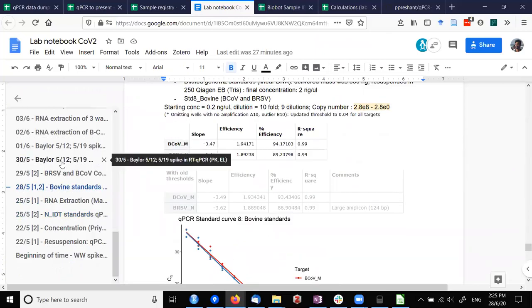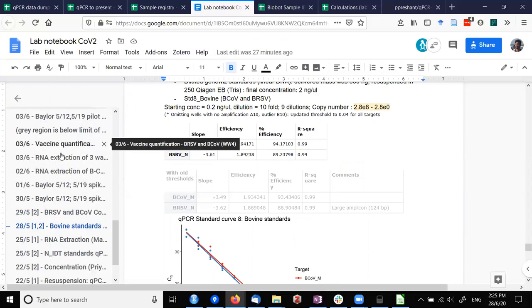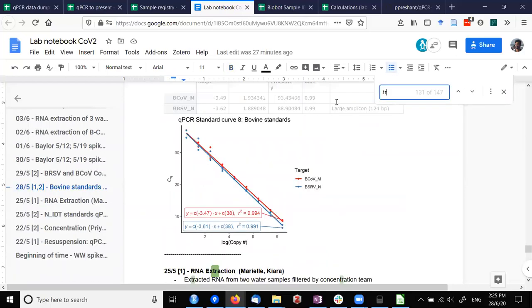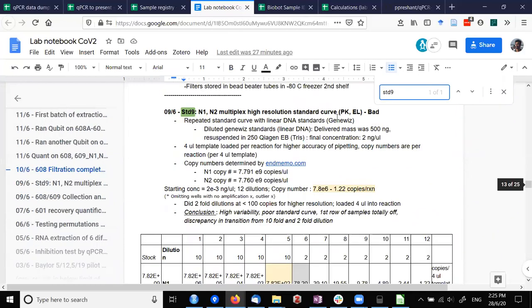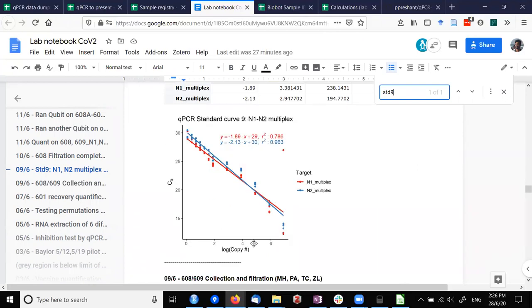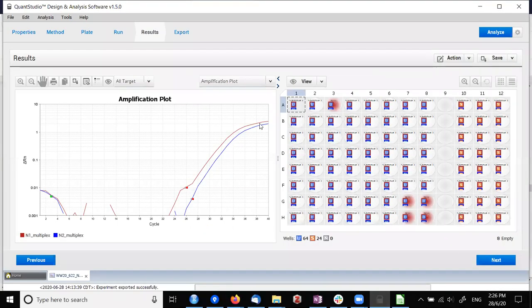Okay. Do you see it, maybe this isn't relevant to what we're talking about right now, but do you see that in the same samples? Like, is it always the standards that are over the efficiency? Yeah, so if you calculate efficiency only with the known standards. Right, okay. For unknown samples, there are other ways that you do it. I've been trying to get it to work, but I haven't started on that yet.